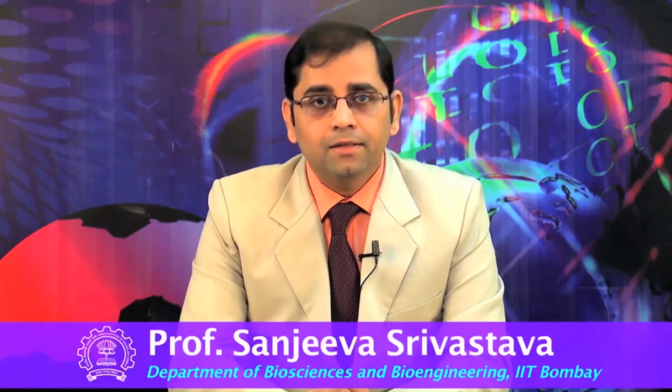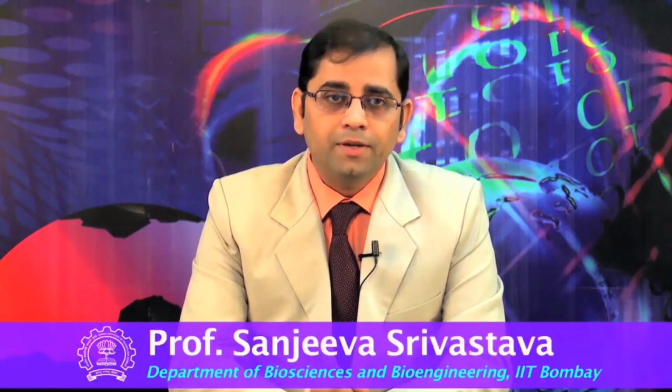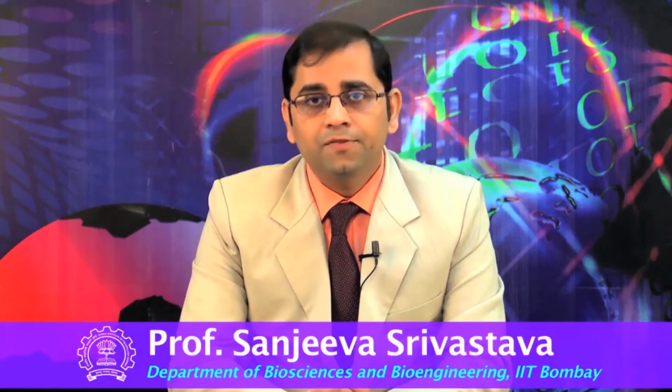After understanding the two approaches for pathway enrichment and the basic differences between both approaches, we will now listen to Dr. Carsten Krug, who will explain the use of GSEA for pathway level analysis of different PTMs by taking an example of phosphodata. Dr. Krug will talk about the way one could analyze the available data at gene level to take it to the PTM level.